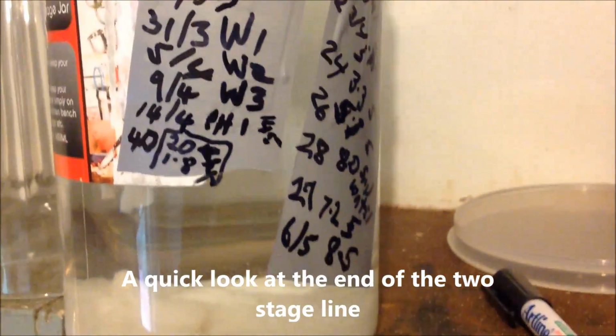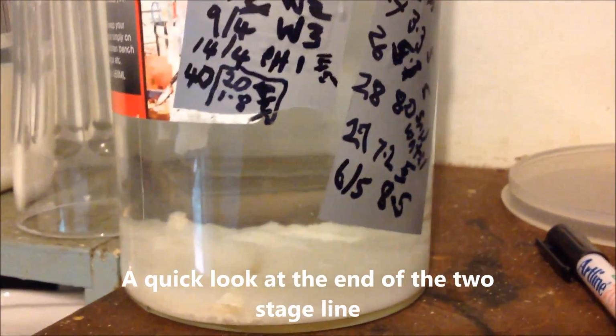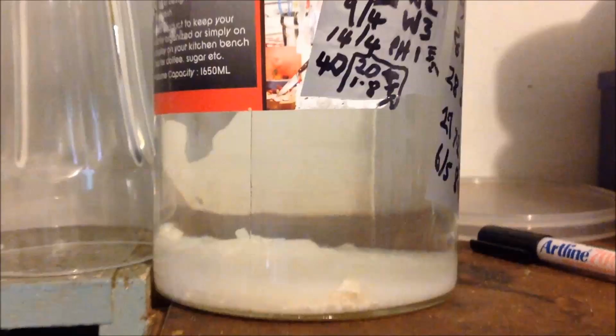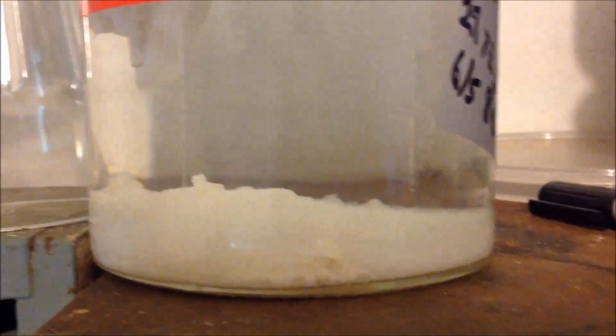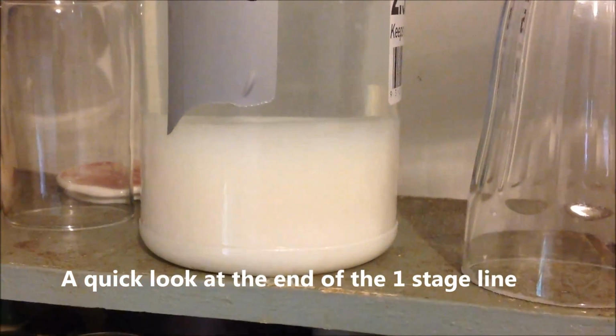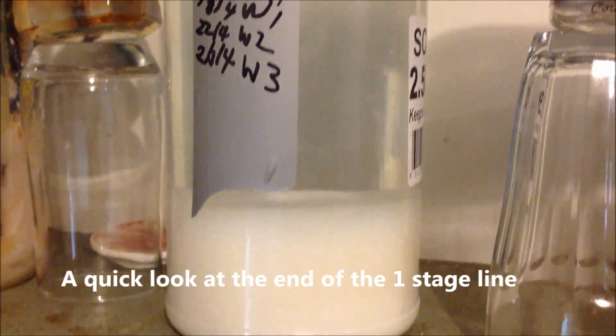120B, second stage precipitate, 6 to the 5th, 8.5 pH. See that there? Some precipitate, and you can see there's a bit of a nodule on the end of the wick as well. Try and get that. 120C, first stage precipitate. Third wash is done.